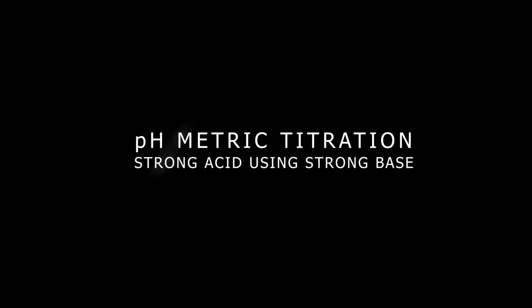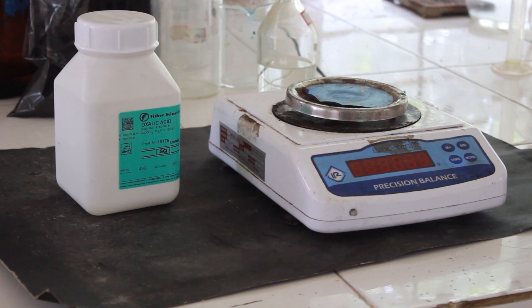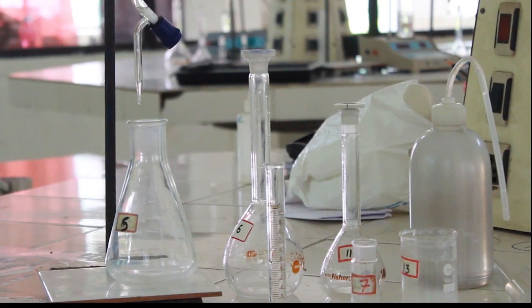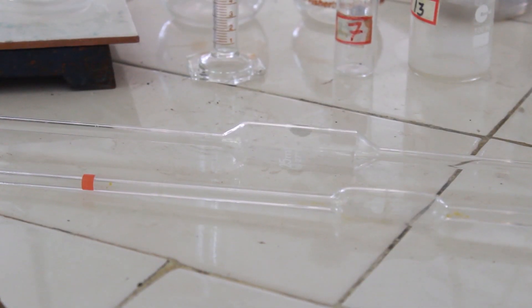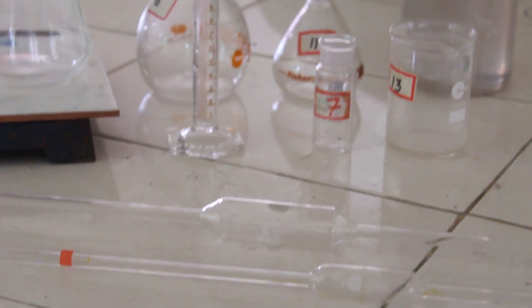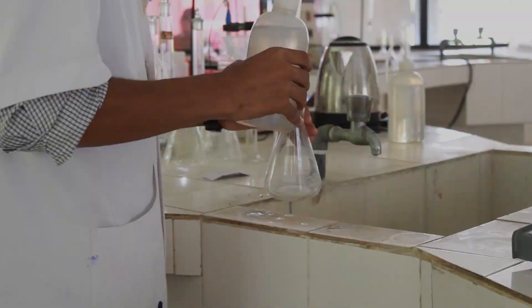Today we will be performing a pH metric titration of a strong acid using a strong base. We are in need of oxalic acid, a digital balance, and all necessary glassware like a burette, conical flask, measuring cylinder, pipettes, and a pH meter with glass membrane electrode.